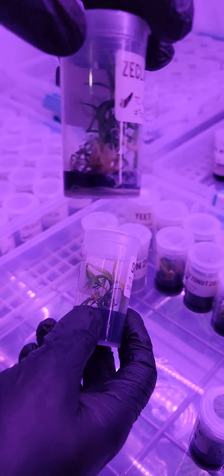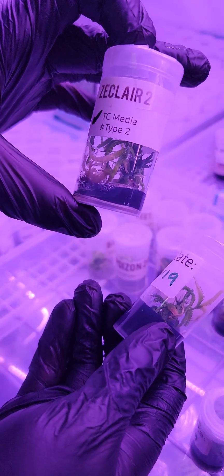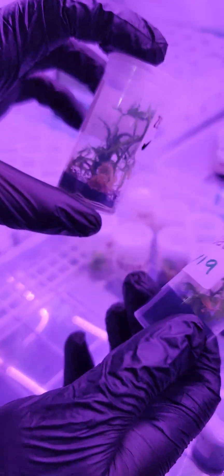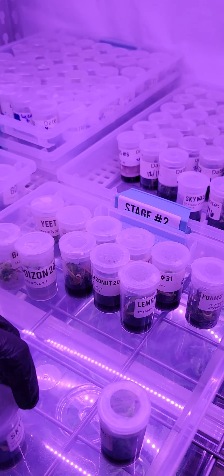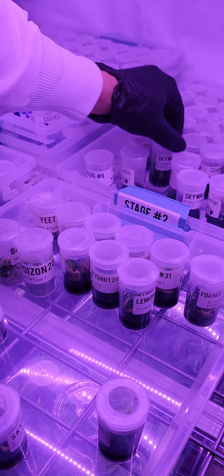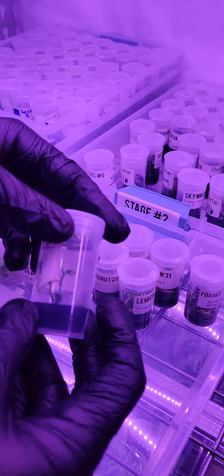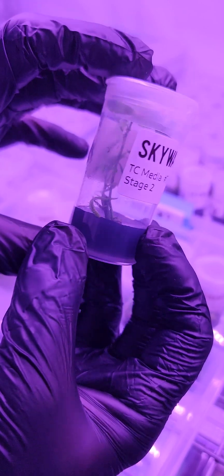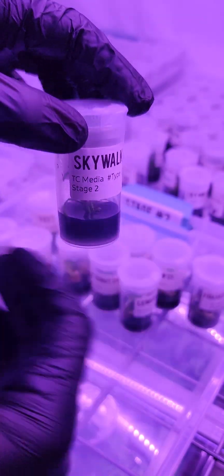Since this one is Stage 1, we don't really want it to root at Stage 1, so I've obviously made a mistake somewhere along the line. But no matter — we'll still remove and propagate it into these Stage 2 containers, where the plant can be as small as this tiny baby plant. Then it grows up into something like this, gets rooted, and once it's rooted we acclimate it back into normal conditions.